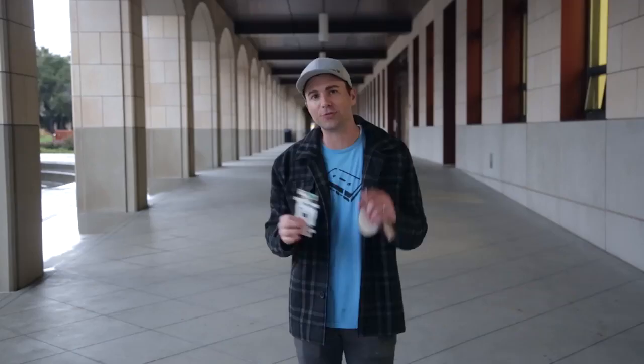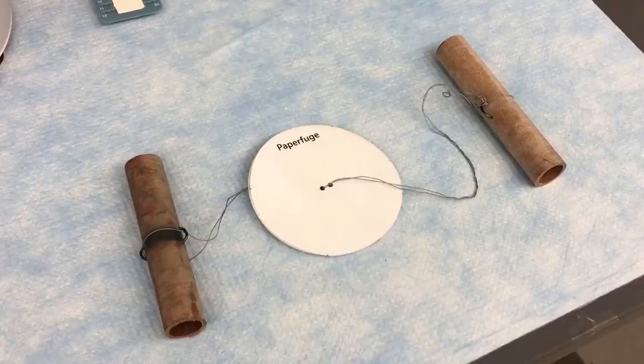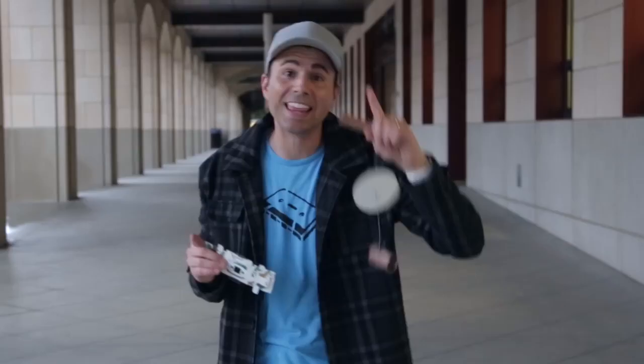I put it together in two minutes and it costs 50 cents to make. And in this hand, I have a blood centrifuge that spins 10 times faster than a $10,000 centrifuge and it costs 18 cents.